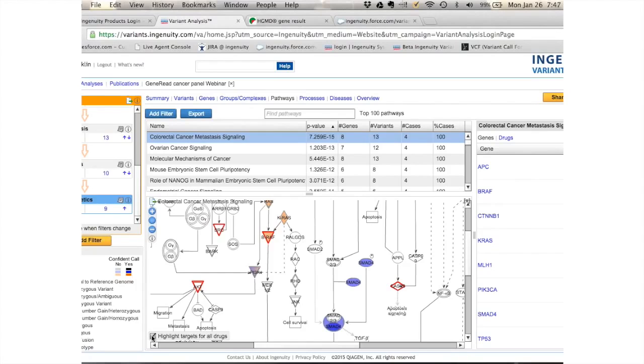So this is a lot of information, so I will pause here for the demo. The goal was really to give you an overview of what you can do in interpretation. So interpretation will be the variant analysis tool, and data analysis, which means from your sequence to calling the variant, is done in the cancer workbench.